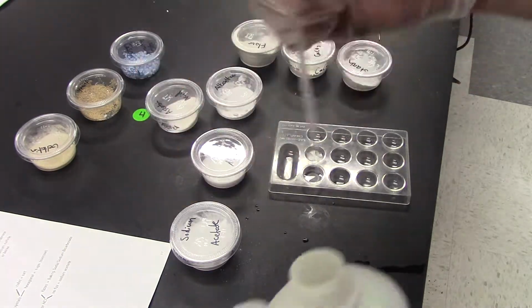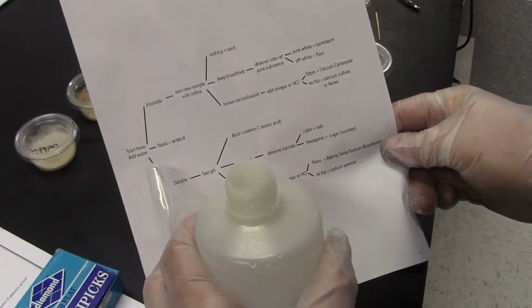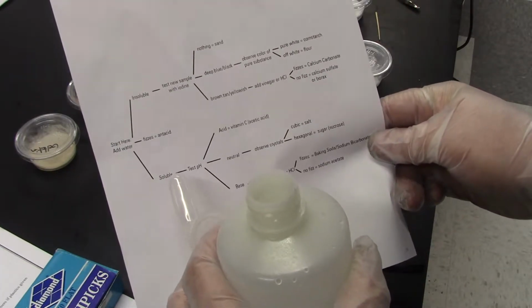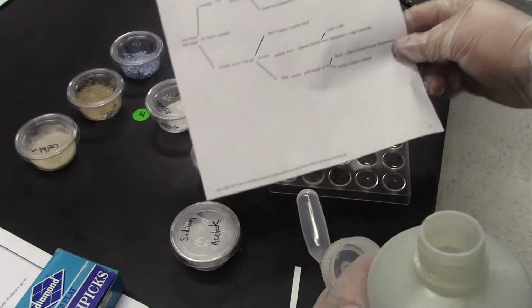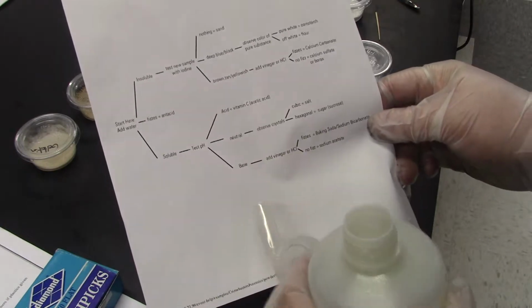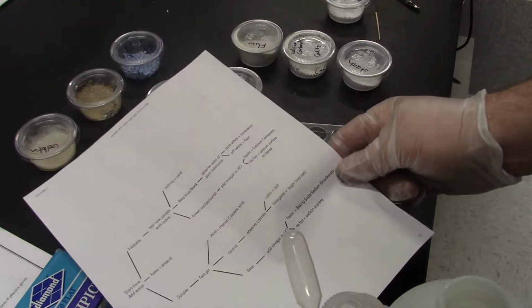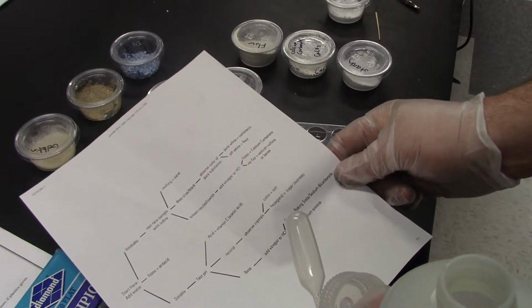So this is the overall way that we're going to figure these out. We're just going to start here, add water, and then basically see what happens. If this goes to here, then we just keep looking. What are our observations that we're making? If there is a substance on here that you do not see, you'll want to come in and test it and run through a series of tests, and you might need to add to this tree. But this would be a document that you can bring with you that should pretty quickly allow you to determine what your unknown powders are.